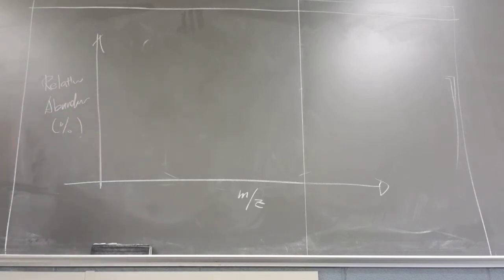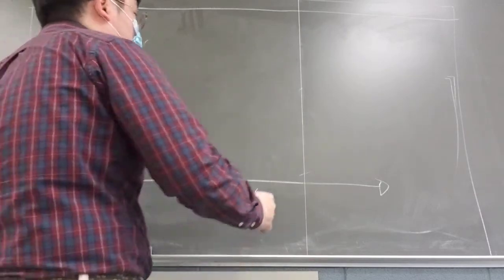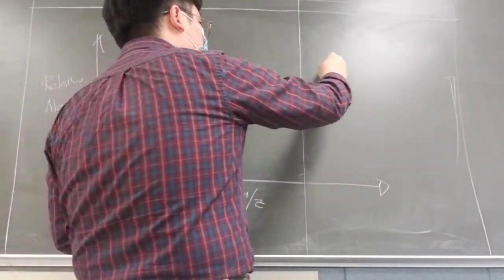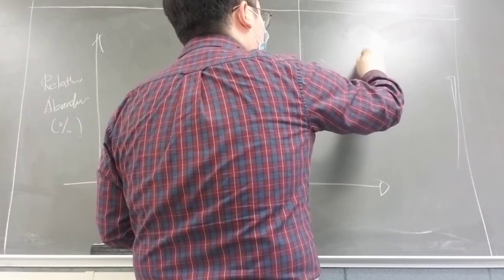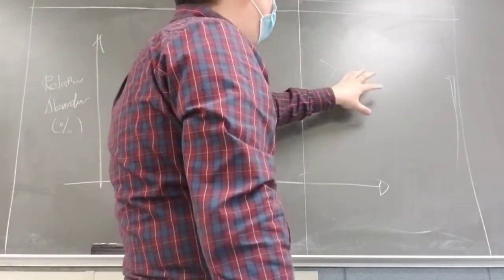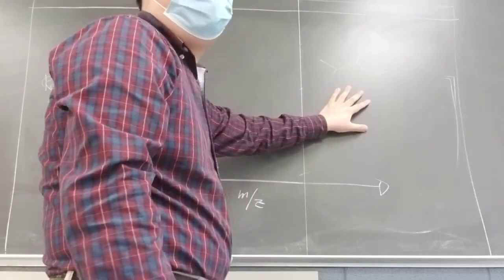So you can have a relative fragment quantity among all the collected data. Okay. So if this is the case, maybe once again we can take a look at alcohol groups. You can try to get some alcohol groups over here. So this is an alcohol because you have a hydroxyl group on this compound. So this is a type of alcohol compound.